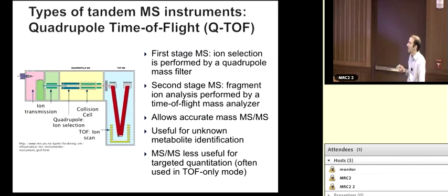So that's why, when you use a TOF for quantitation, you usually use it in MS1 mode. When you're doing MS-MS in the context of metabolomics, it's normally being done for identification or maybe a very limited range of quantitation. There are some exceptions to that, some unique ways of using a QTOF, but by and large, that's still true. And Orbitrap is kind of much the same.